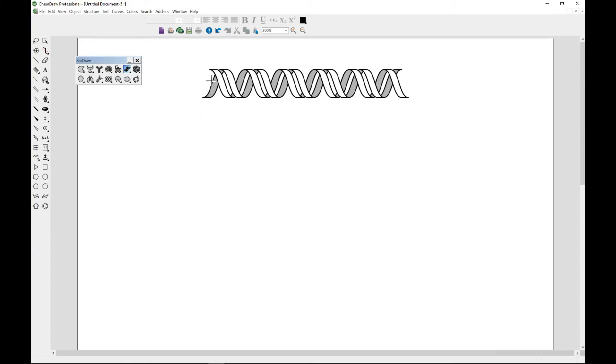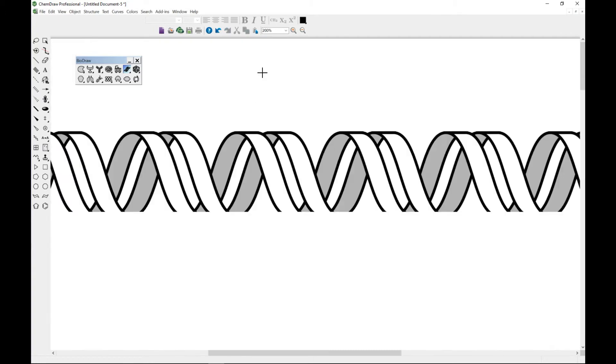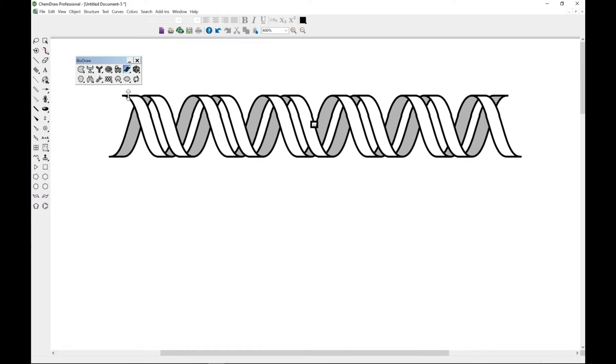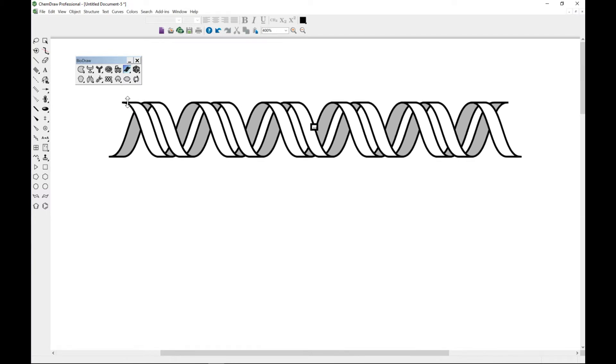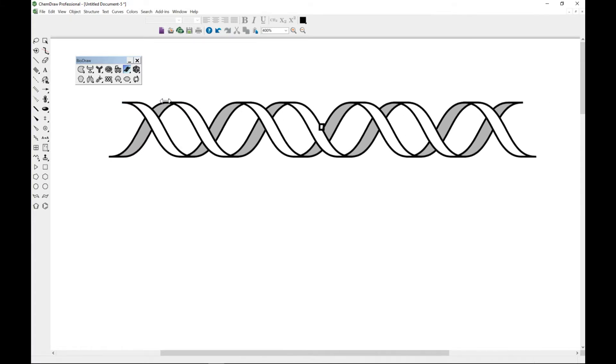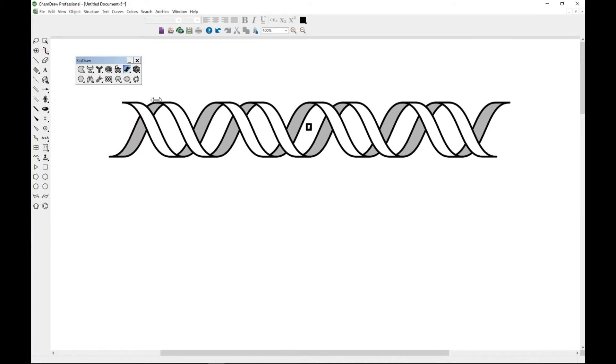With DNA, let's zoom this in a little bit. With DNA you can also make adjustments as we did with the helix protein. You can do height adjustment, so you can bring it here and change the height. You can also do spacing adjustment, so you can bring it here and change the spacing.